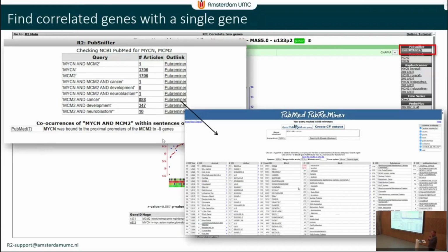So you can find prominent authors, times when literature was accruing about something, what kind of keywords has been used, and you can actually click on all of these elements to make the query smaller and smaller and smaller, using information that's actually based from within these abstracts, and thereby making a smaller selection of something that you may want to read. Also pretty nice program.